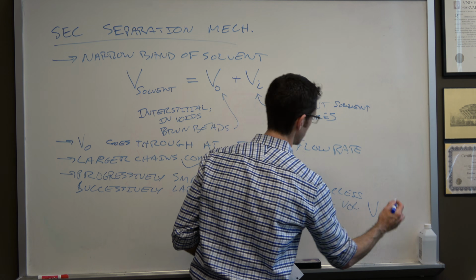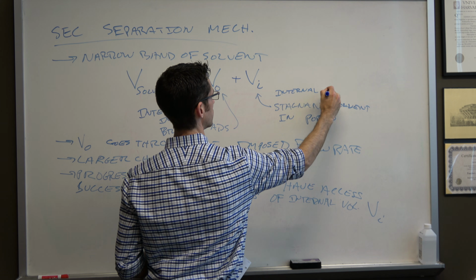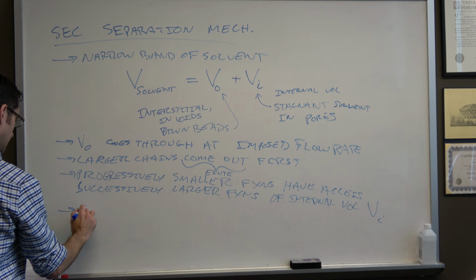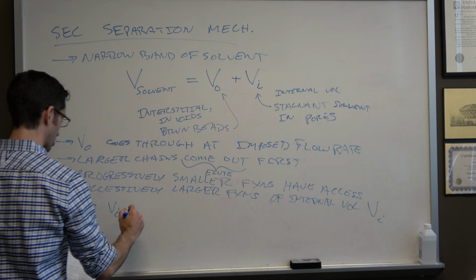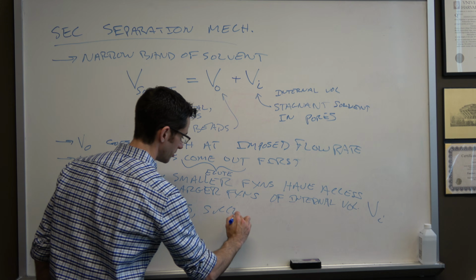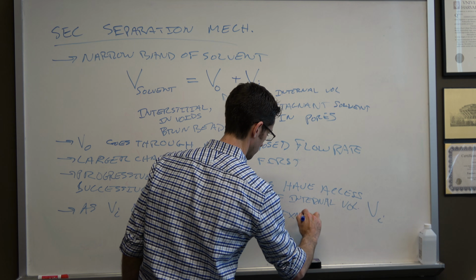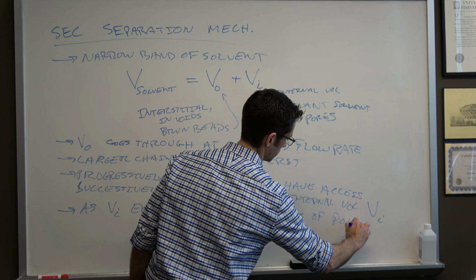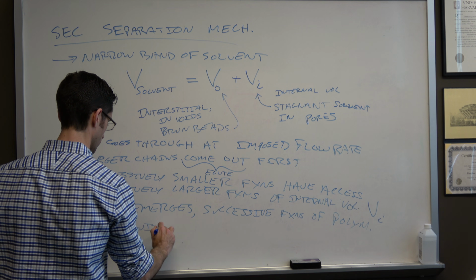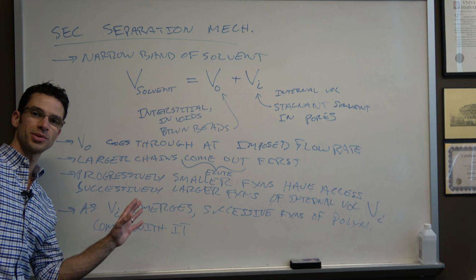The internal volume V I. And as the internal volume emerges, successive fractions of the polymer come with it. Okay, got this? You can pause it if not.